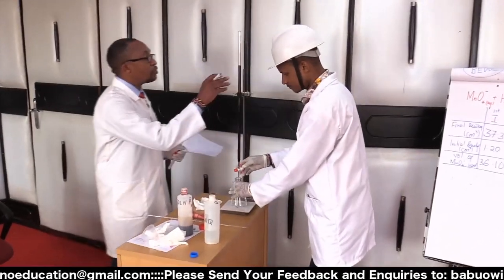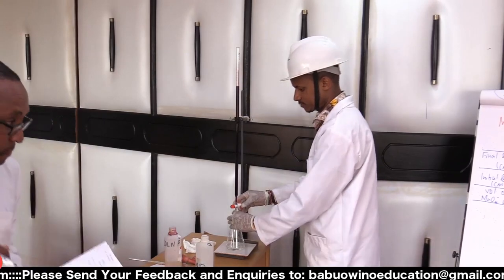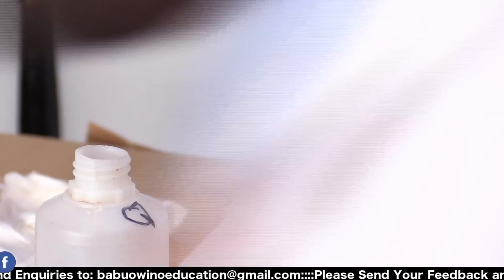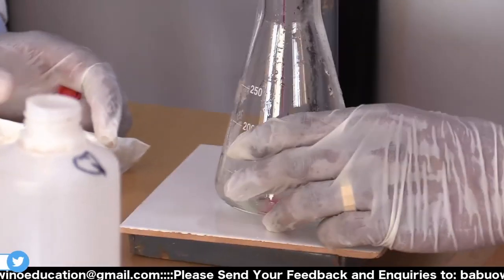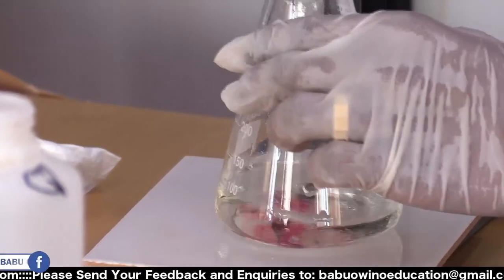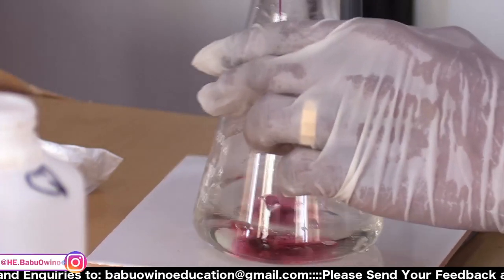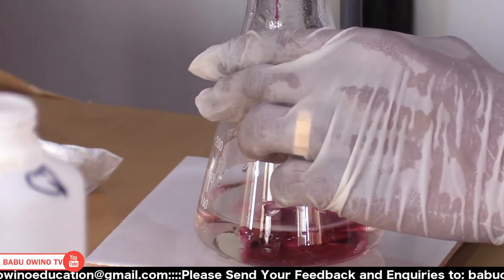The initial reading, confirm: 9.4. Yes. So now work it out. You keenly observe what changes in the reaction. If you are those people who give up, thinking you are running too much solution, then you lose it. So you continue, and you are swaying. The reason why you sway is to make it mix uniformly. Like you can see, our solution here is mixing uniformly.